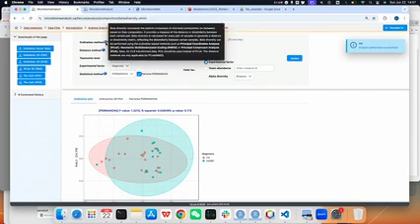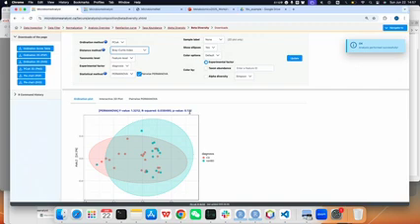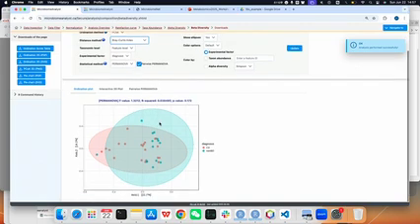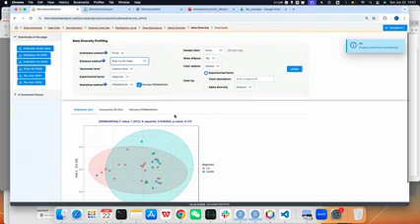So you can use the question mark to look into the details, and you can try different methods for exploration. And we have this statistical method to tell us if the group variation is significant. We can see here, it seems that the two groups didn't have too much difference based on this method.